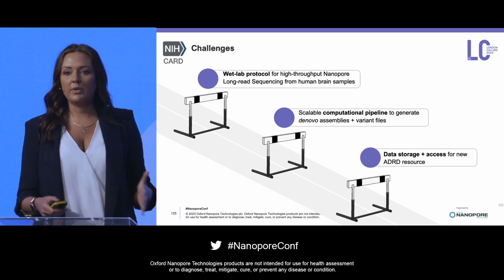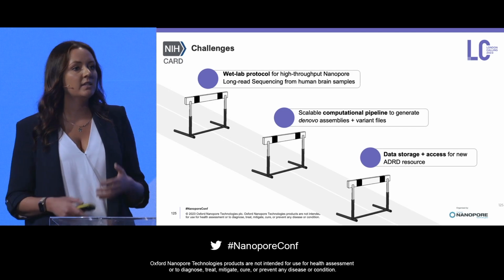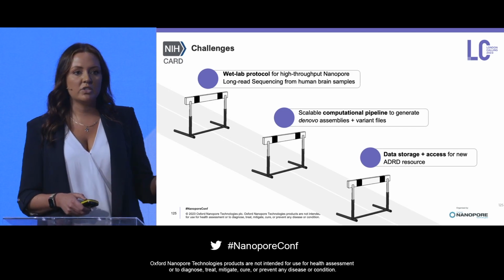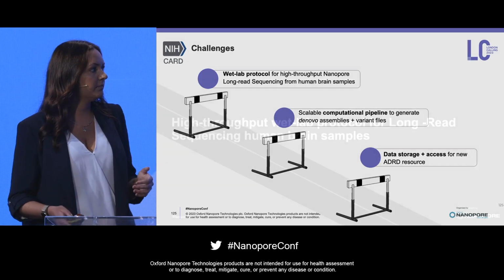Everyone here knows how big nanopore data can be. Per genome, it's about 1 or 2 terabytes. So if you multiply that by 4,000, it's a huge amount of data. We've been very fortunate here to get support from nonprofit organizations to support us with this.